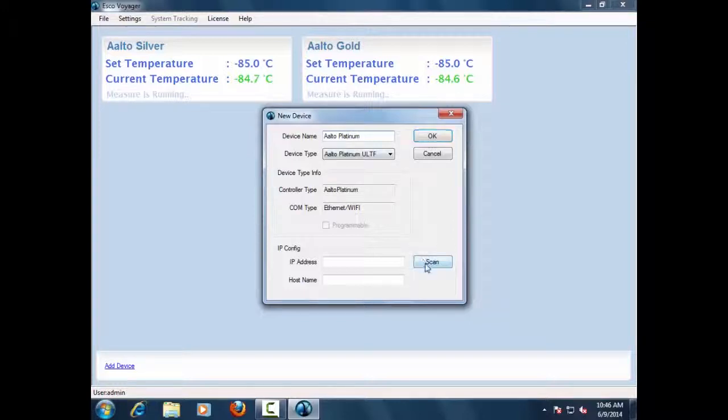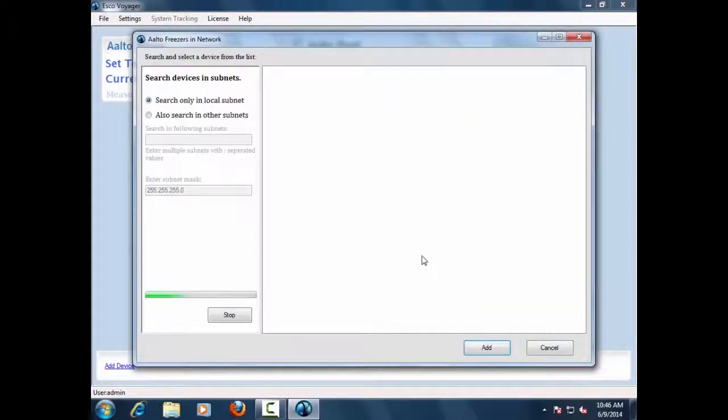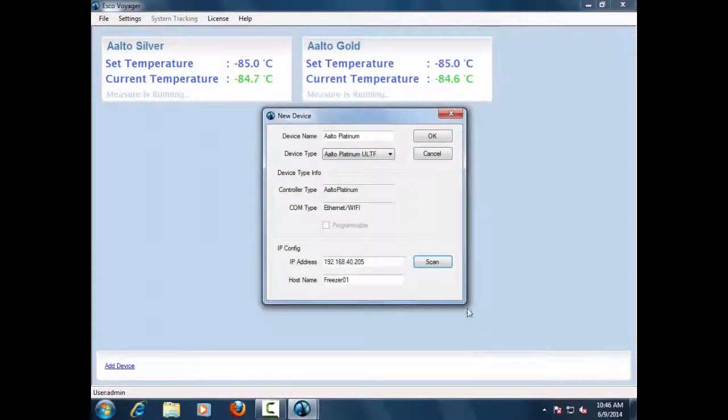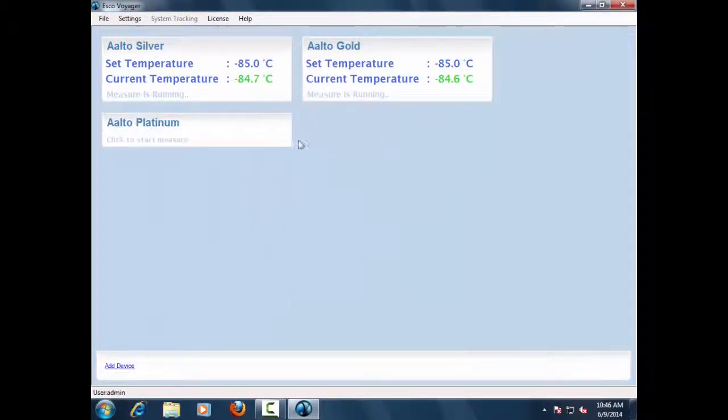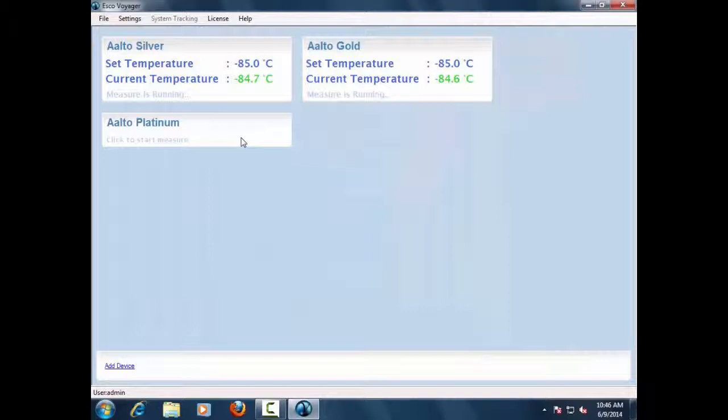The ESCO Voyager software will automatically detect the Lexicon 2 ULT Freezer with Alto Platinum Controller on the facility network via Wi-Fi or Ethernet interface. Up to 64 Lexicon 2 ULT Freezers with Alto Platinum controllers can be connected on the Voyager software system.